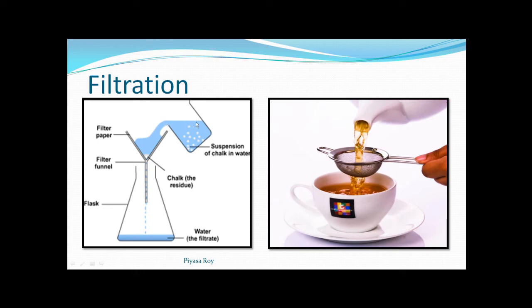But the chalk, as the chalk particles are bigger in size, will be left behind in the filter paper. They will get stuck in the pores. The filter paper will not allow the chalk particles to pass through it, so they will be left behind in the funnel, in the filter paper, which is called residue.